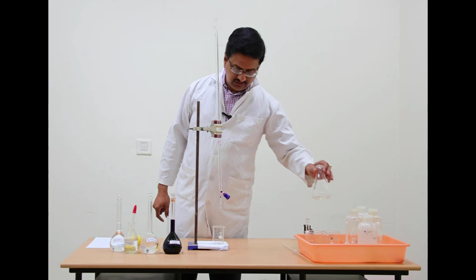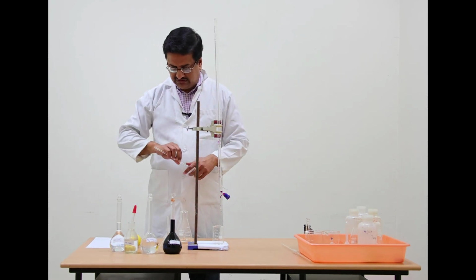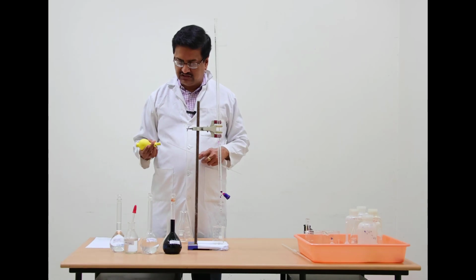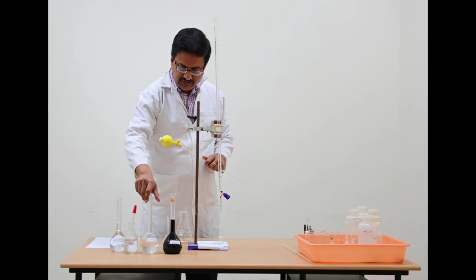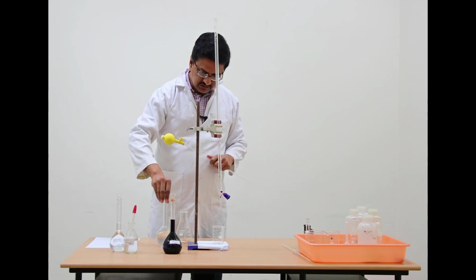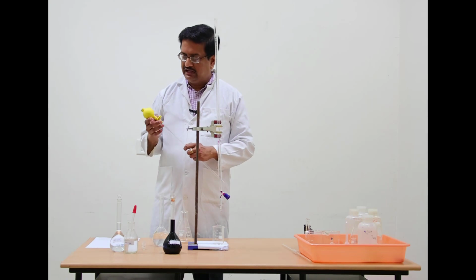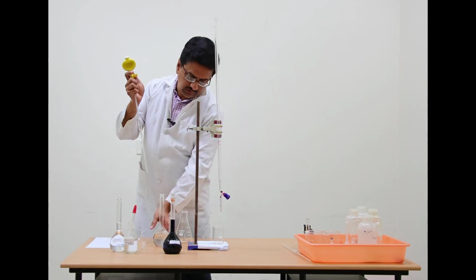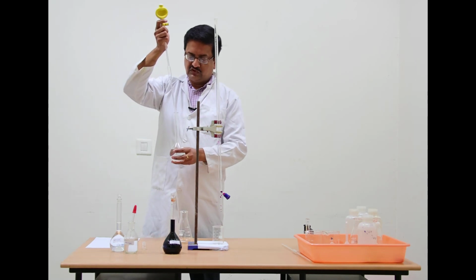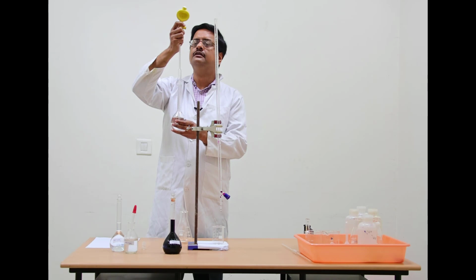So to start with, we first need to pipette out 10 ml of oxalic acid solution using a pipette and a pipette pump, which you already have learned in your previous couple of experiments on acid-base titrations. So now I am going to pipette out 10 ml of oxalic acid using this pipette pump.